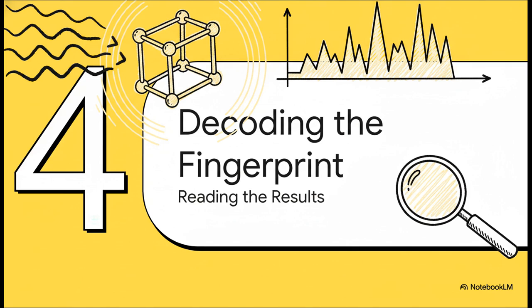All right, so we've fired our X-rays. Bragg's Law has done its thing, and we have a signal. What do we actually get? Well, we get a graph, that unique pattern we've been talking about. Now let's figure out how to read it.